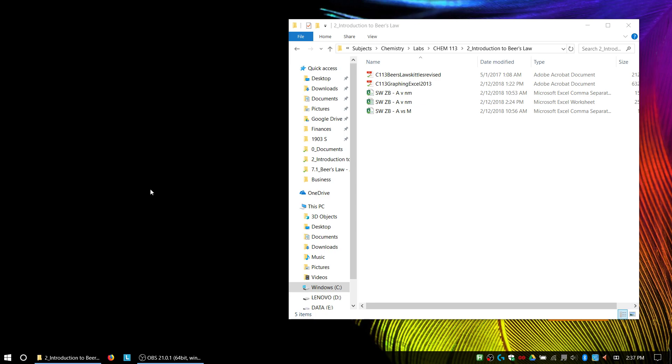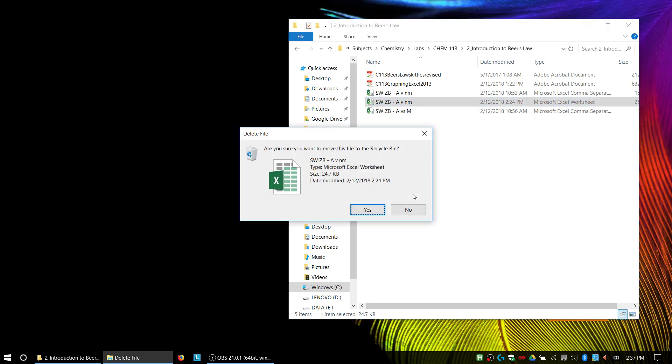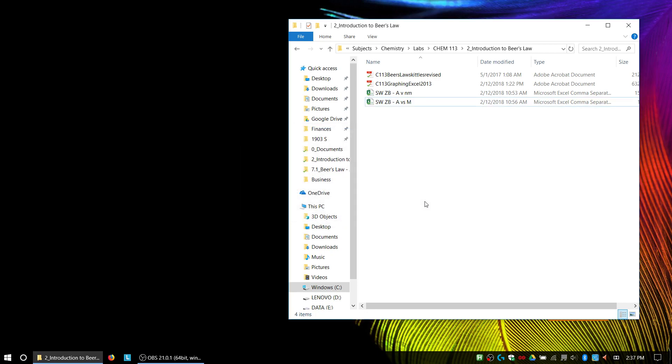First off, you downloaded your data as CSV files, so you're going to have two separate files: one for your spectrum and one for your calibration plot.